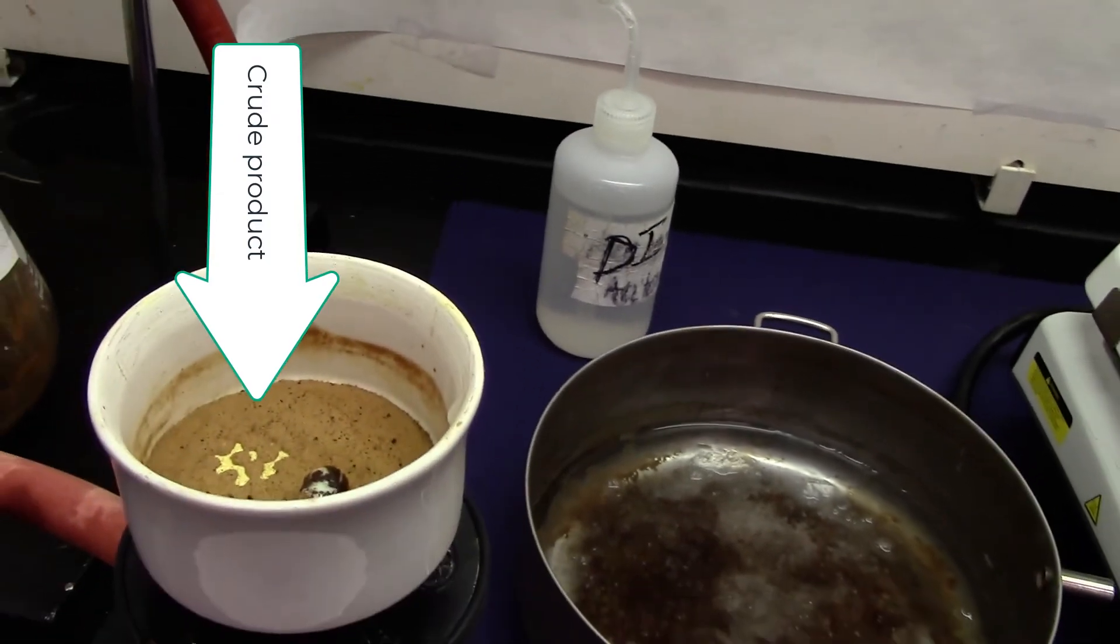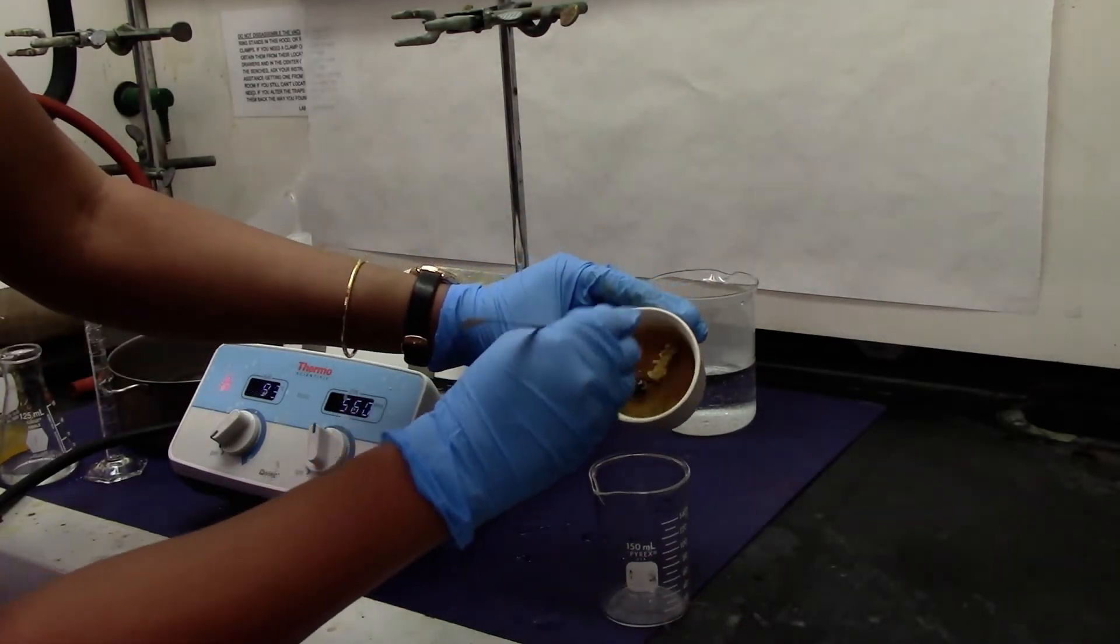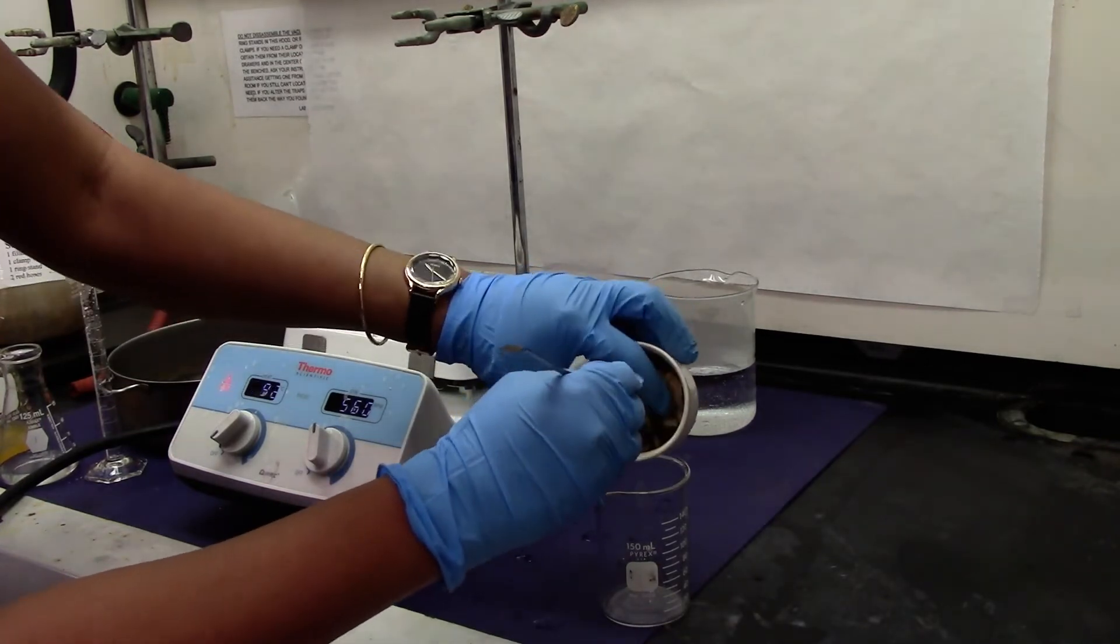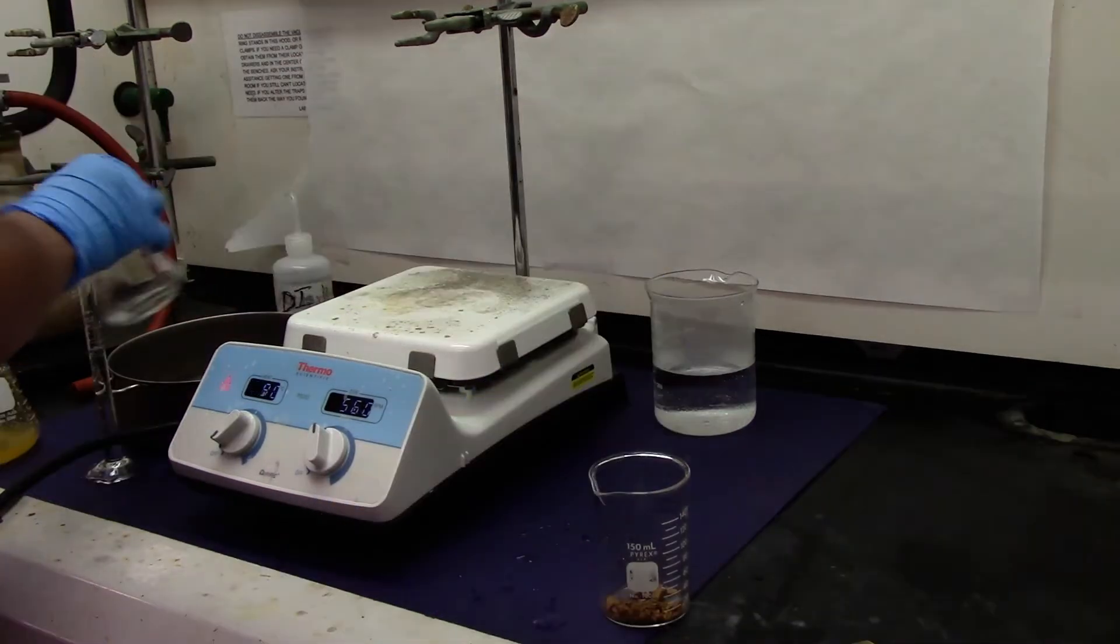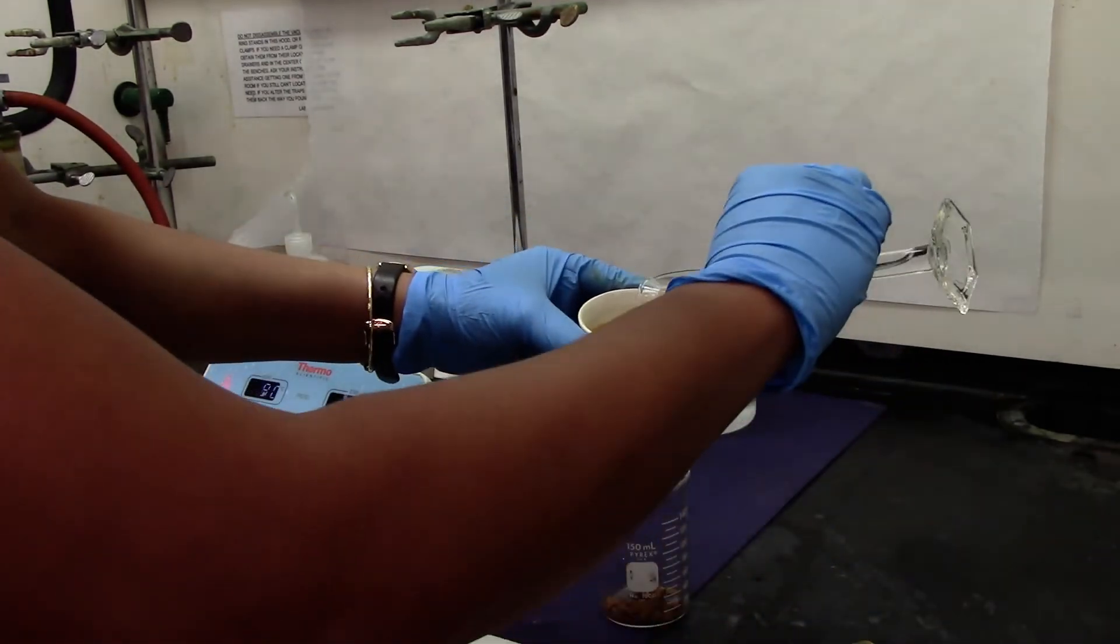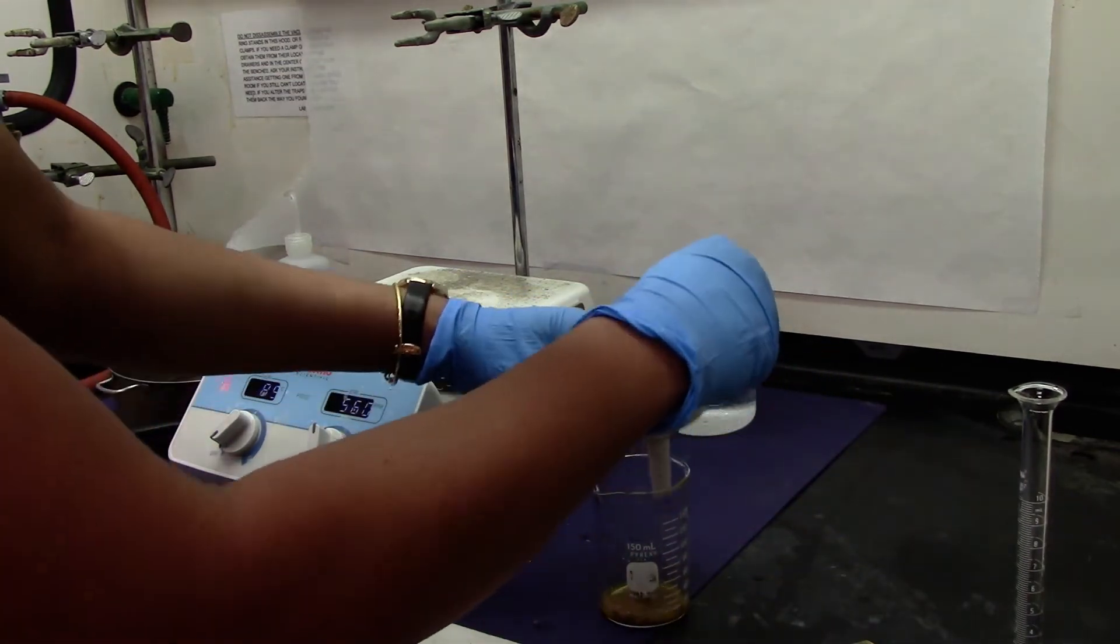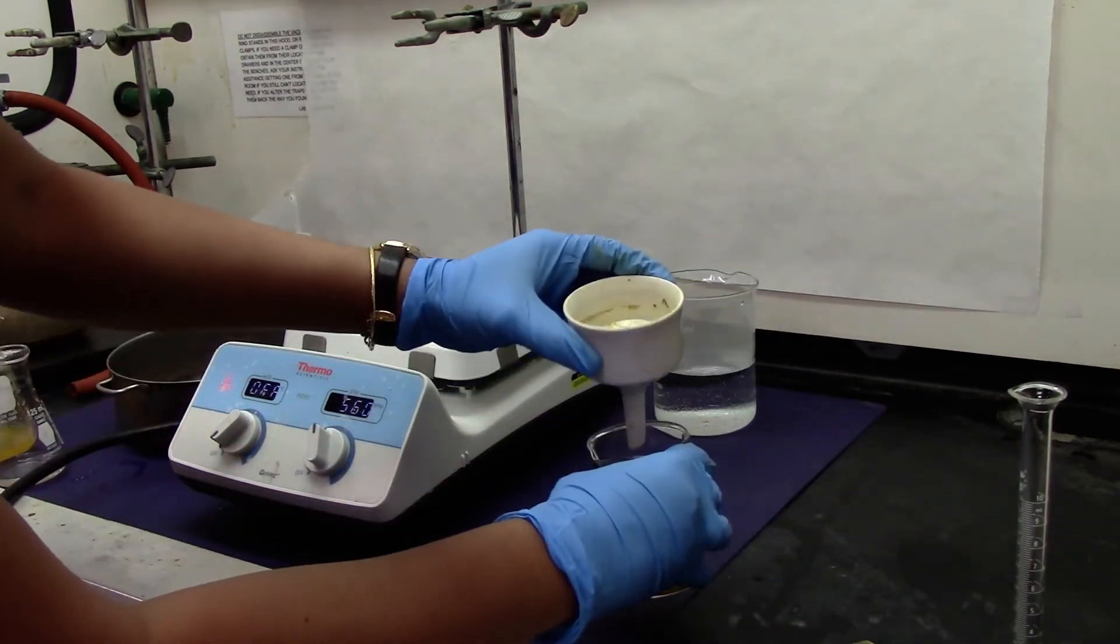So this is how the product looks like. We will go ahead and transfer our product into a beaker and add about 9 mL of ethanol. I am washing the funnel so I can get all the product into my beaker.